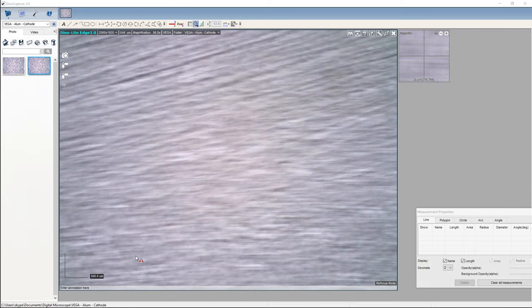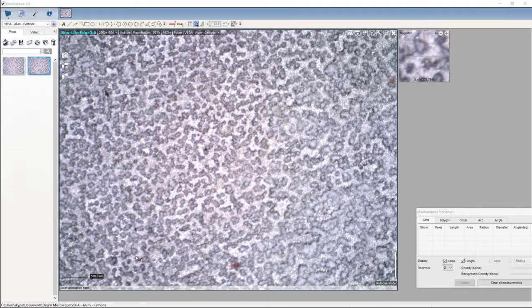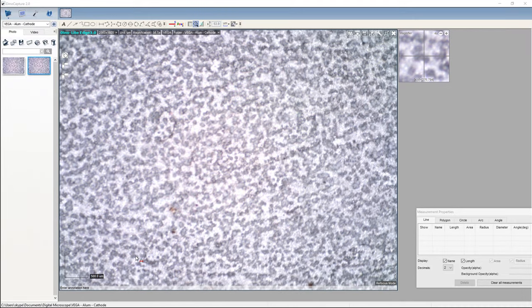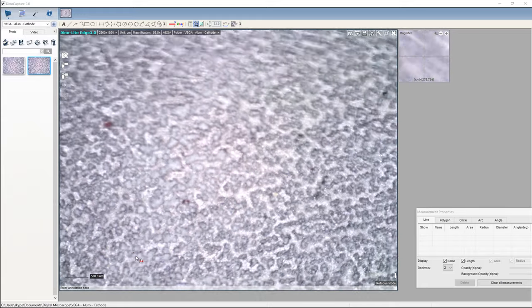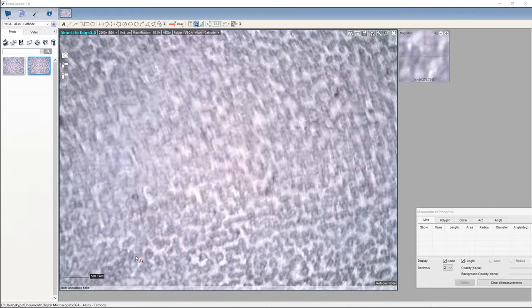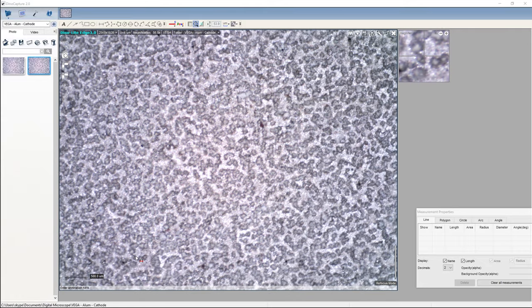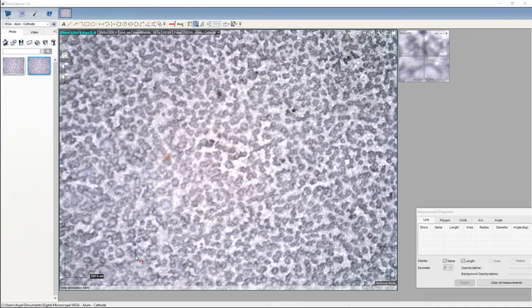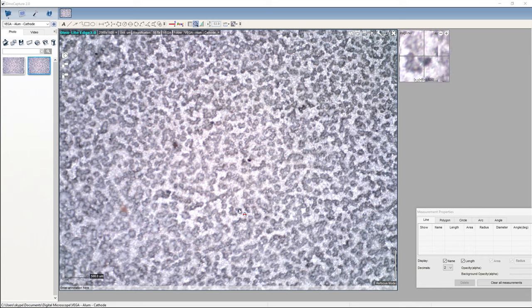Okay, so we're going to move that back to the center. Somewhere around here where there's plenty of them and they're big. Then we're going to move the other direction here. And again, it gets smaller and smaller and smaller until you can't really notice them much. Okay, so let's look at this central area and we can maybe zoom into some of these. Okay, and some of these look white and some of them are kind of black bits here.